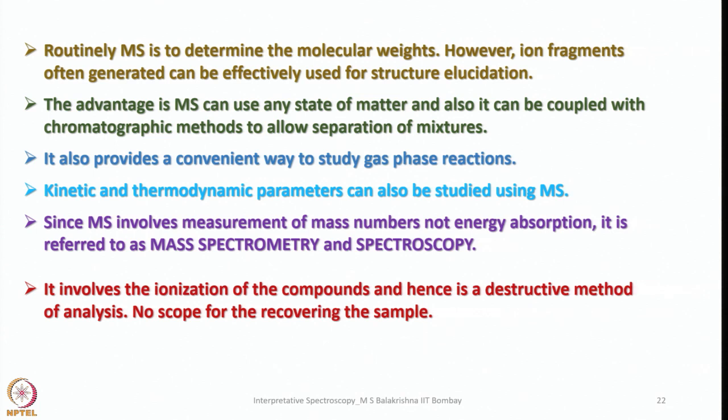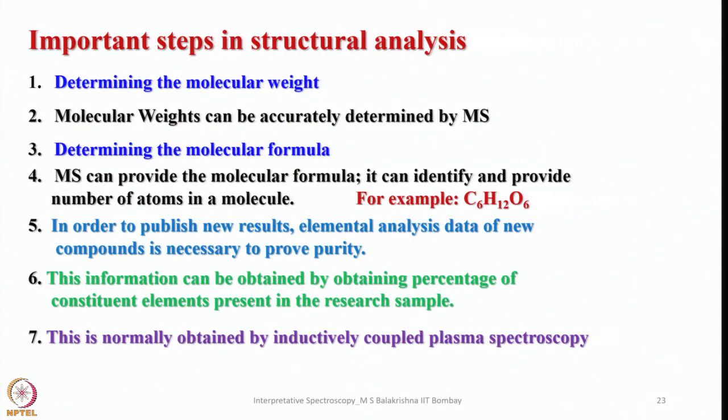That means to get molecular weight and also ionization and fragmentation. So this is a destructive method. So important steps in structural analysis: first of all, the sole intention is to determine the molecular weight, and molecular weight can be accurately determined by mass spectrometry. That's the major advantage.